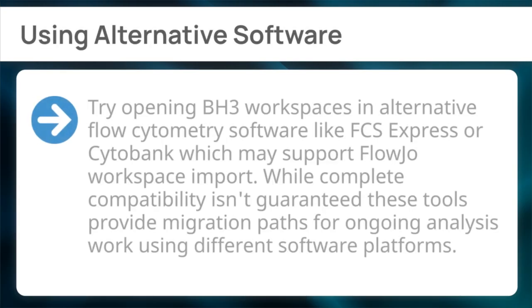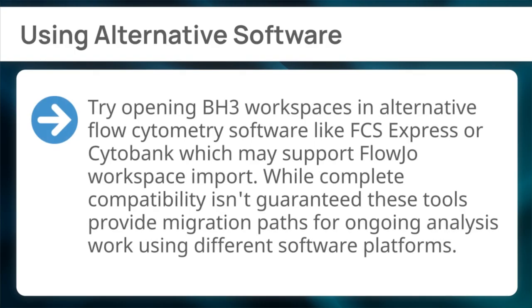Finally, using alternative software. Try opening BH3 workspaces in alternative flow cytometry software, like FCS Express or Cytobank, which may support FlowJo Workspace import. While complete compatibility isn't guaranteed, these tools provide migration paths for ongoing analysis work, using different software platforms.